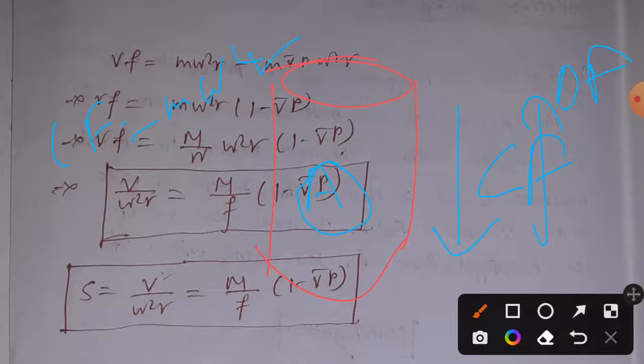This buoyancy force is m v bar rho omega square r. The actual formula is m0 omega square r, where m0 is the mass of the solvent occupied by the particle, but the mass of the fluid displaced is not easy to measure without a formula. So m0 is equal to m v bar rho, and we have replaced it with that.